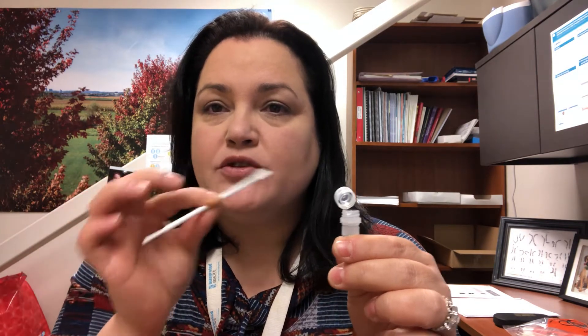So you'll take this swab — and it's recommended that you don't eat or drink 30 minutes prior to taking this sample, no smoking — and you're just going to gently rub the inside of both cheeks a couple of times to get some of the DNA from the inside of your mouth.